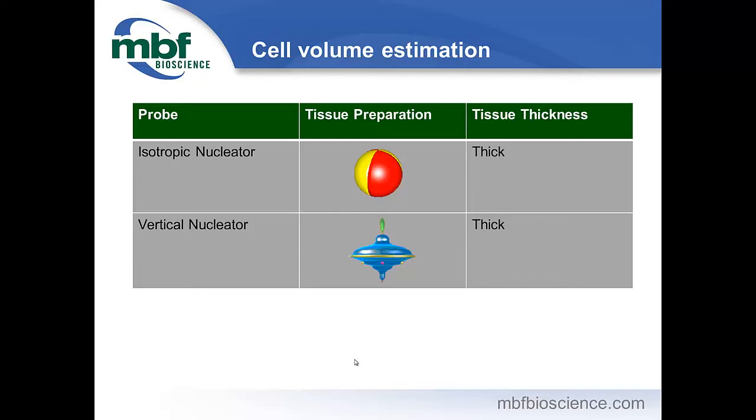So if you don't know if they are isotropic, then you have to take pains to ensure that you achieve sampling isotropy with the probe and with the tissue preparation. As Dan mentioned, there are some reports in the literature of proving isotropy of a population of interest. There's a paper by Christoph Schmitz and Patrick Hof that looked carefully at a population of cells in the striatum, I believe, in order to demonstrate that those cells themselves have no preferential orientation in the striatum, and therefore you can prepare your tissue with a preferential orientation for that region.